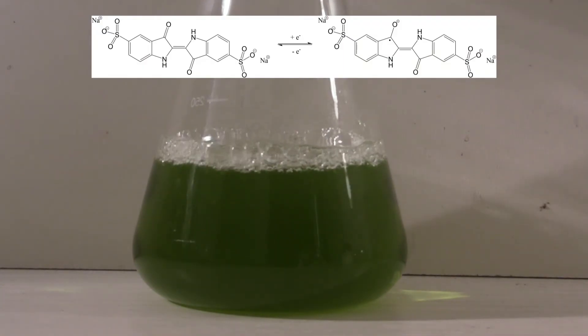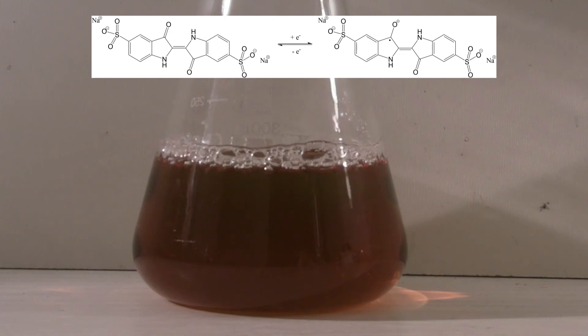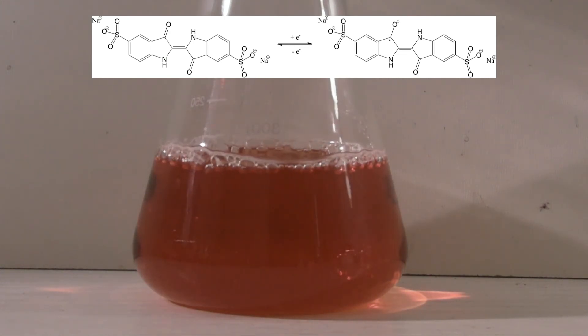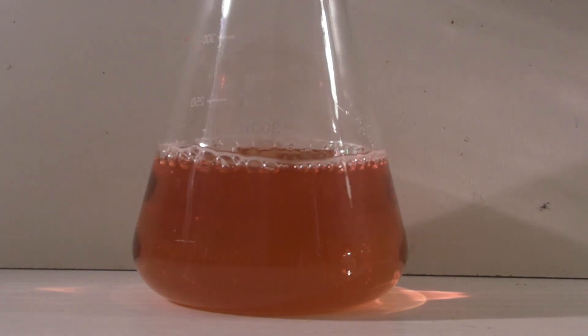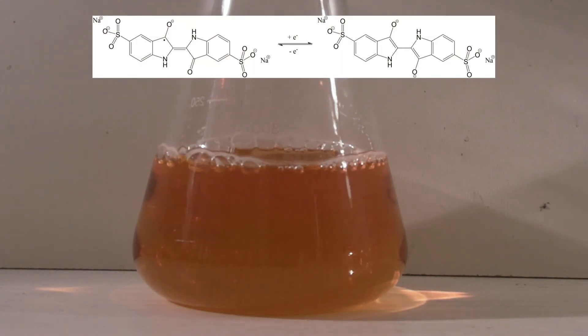The red color is due to a radical anion forming between the completely oxidized and reduced states. This is then reduced to the leuco form.